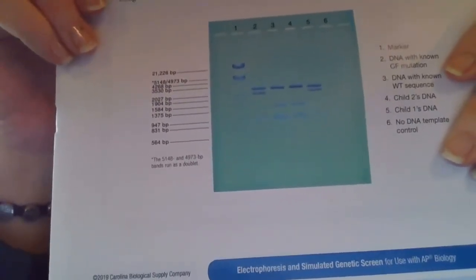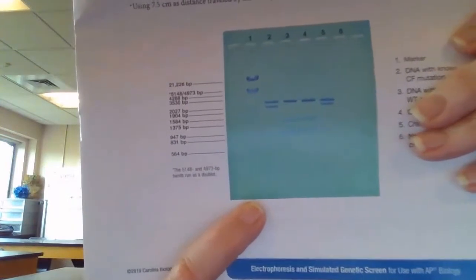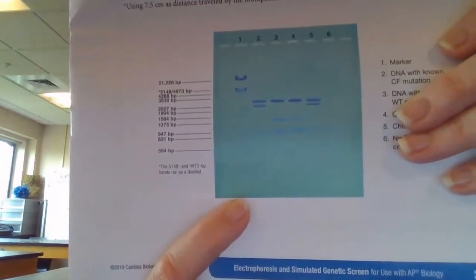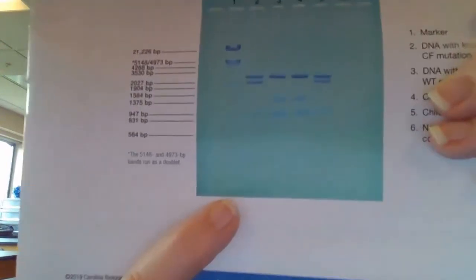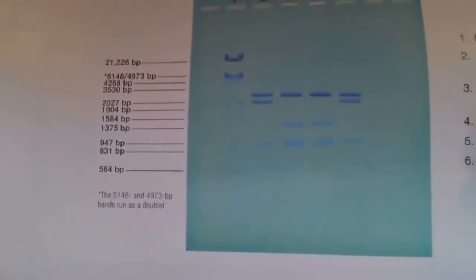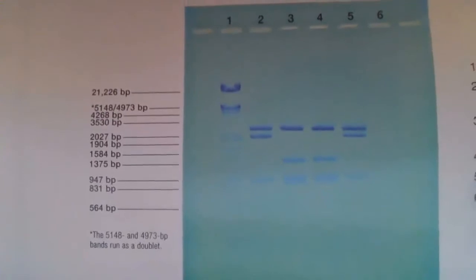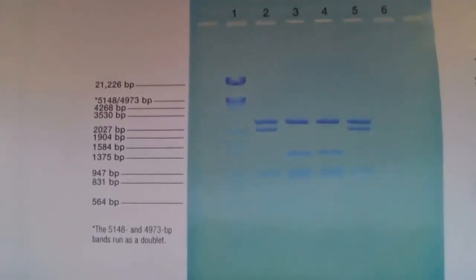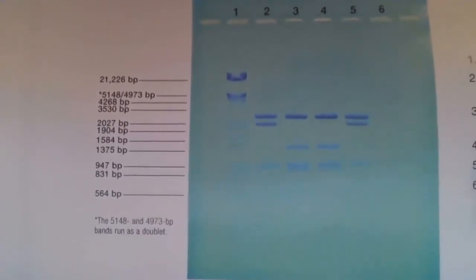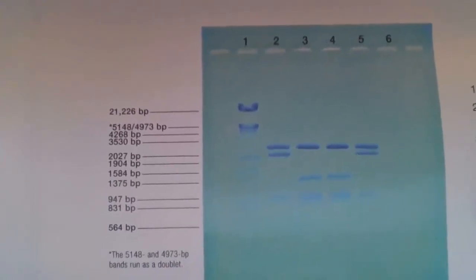So what you're looking at is in this first one right here. That well number 1, that was our marker DNA. So you're going to see a bunch of lines. You see a bunch of places where the DNA was stained. And then in well number 2, I believe that was the cystic fibrosis known banding pattern. In lane 3, you have a wild type. That's somebody who's normal.